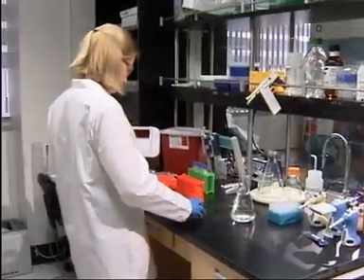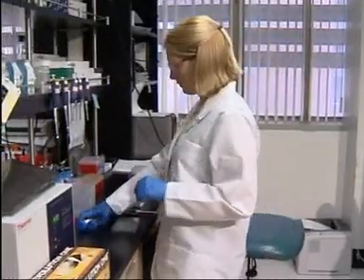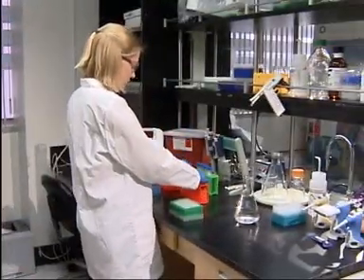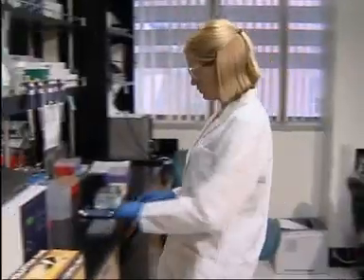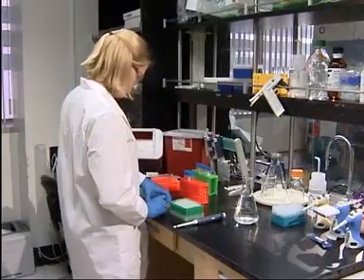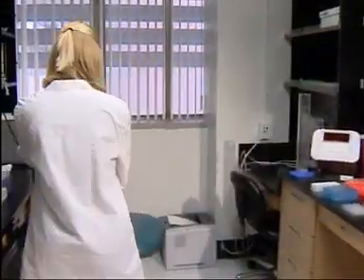Setting up your laboratory bench properly will help alleviate musculoskeletal discomfort and avoid injuries that can develop over time. Repetitive, forceful gripping combined with awkward postures can affect your nerves, tendons, ligaments, joints and spinal discs.